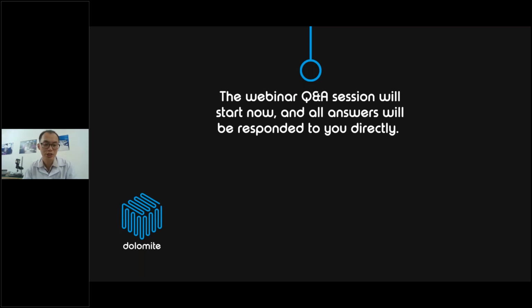I hope the content of this webinar today will help you very much with your emulsion creation for your application. We have a very wide area of surfactant use in applications, so for a specific application you would use a specific surfactant. But I hope the content of today guided you in your process.